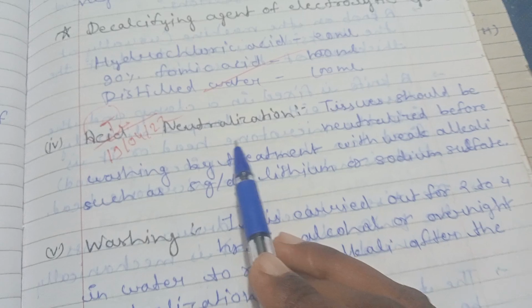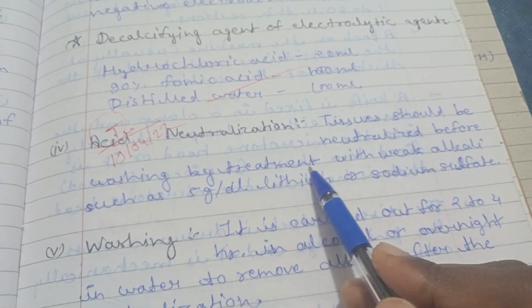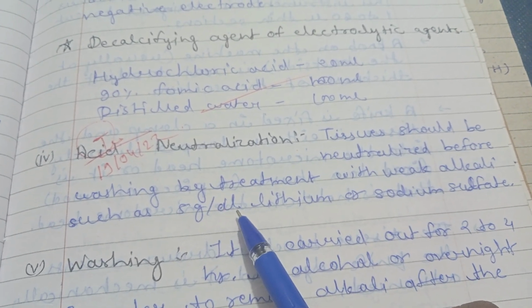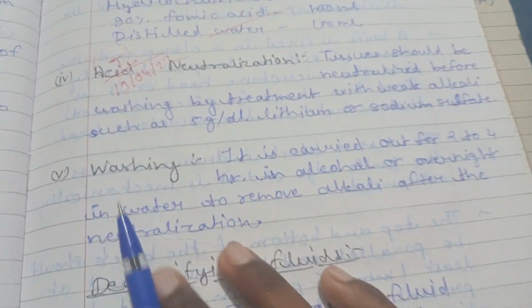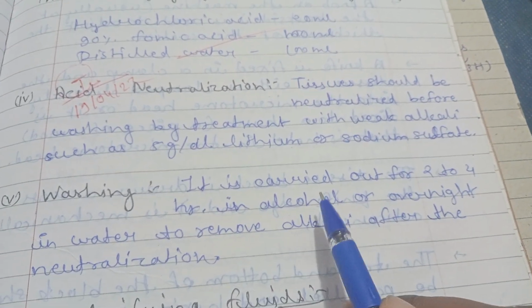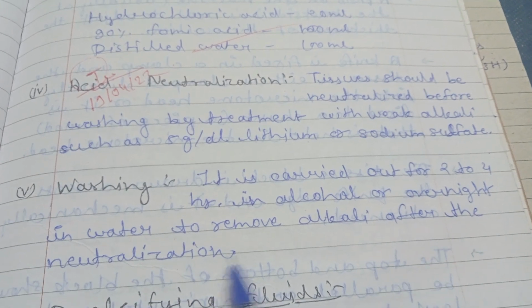And acid neutralization. The tissue should be neutralized before washing by treatment with weak alkali such as 5 gram per deciliter lithium or sodium sulfate. Washing. It is carried out for 2 to 4 hours in alcohol or overnight in water to remove alkali after the neutralization.